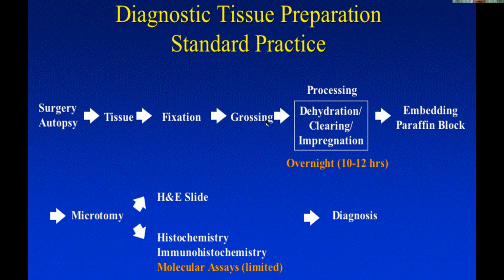During grossing, we cut the tissue very thin, around 3 to 4 mm. With these thin sections, it's quite difficult for us to further section to make it into a slide. So here comes the embedding process, meaning we need to put some substance.